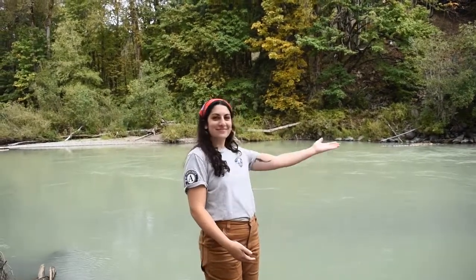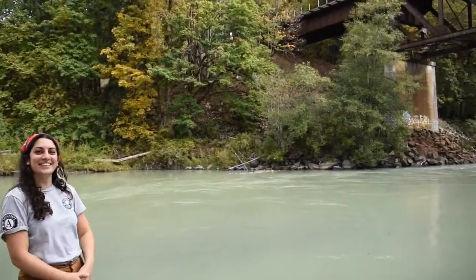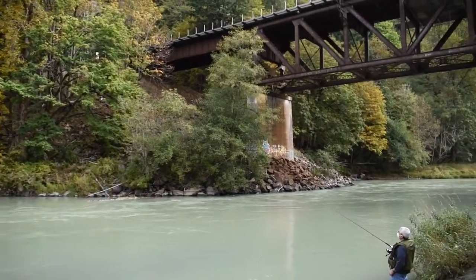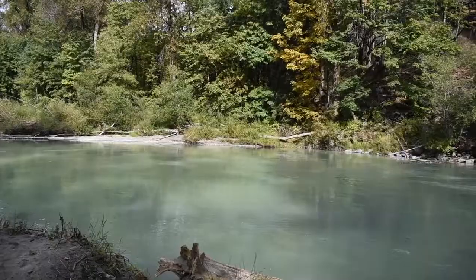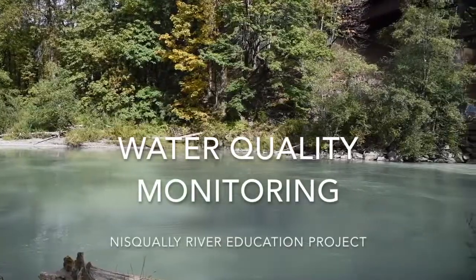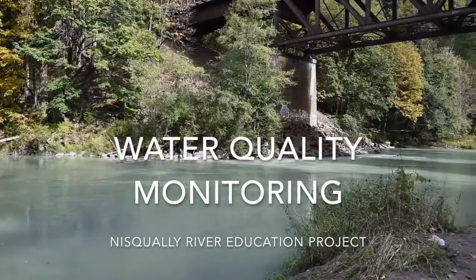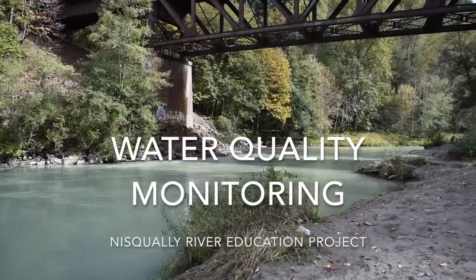Hi there! My name's Maya and today we're here on the beautiful Nisqually River at the 6th Avenue Handicap Access fishing spot. I work with the Nisqually River Education Project and today we're going to show you how to do water quality monitoring.